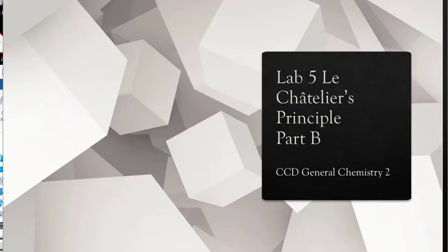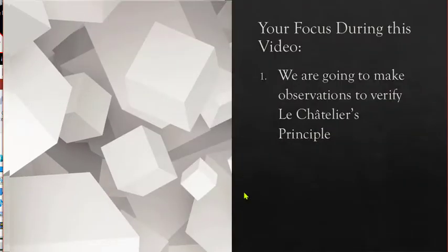In this second video, part B, what we're going to do is look at part B in the lab. So we're on page 7, lab 5. And again, the focus of the video is we're going to do observations to verify Le Chatelier's principle.